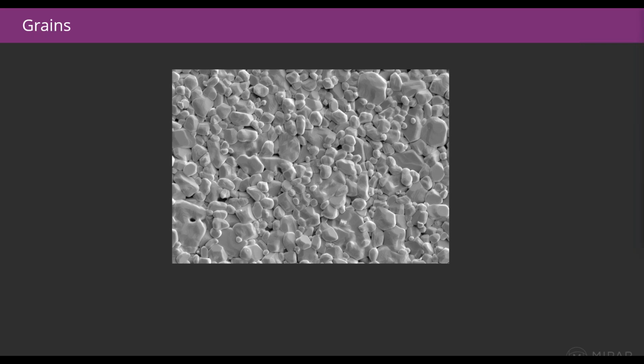Then you take that processing and you prompt it either with a point or a box or a collection of points, and based on your prompt, it returns back a segmented feature from its initial interpretation. So much of image analysis now with tools like this is almost a form of prompt engineering, which I know we're getting a lot more familiar with the nature of using these modern language-based AI tools.